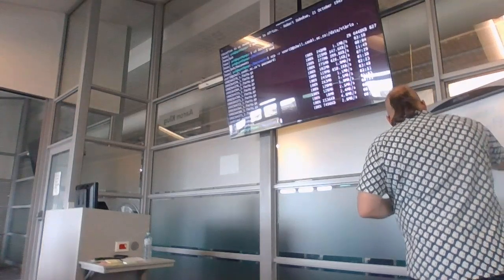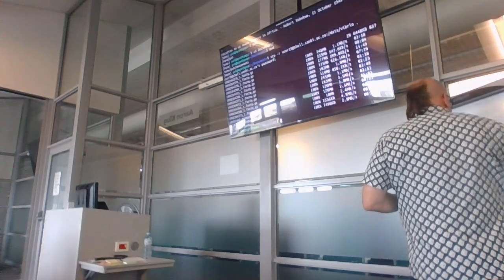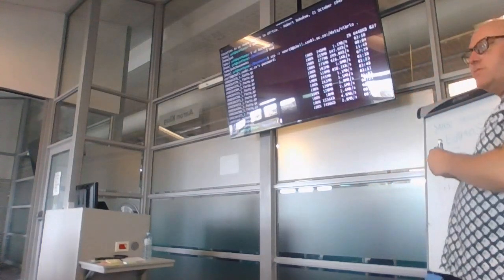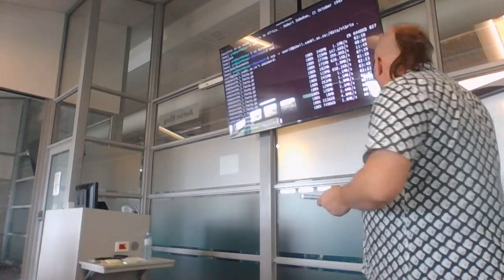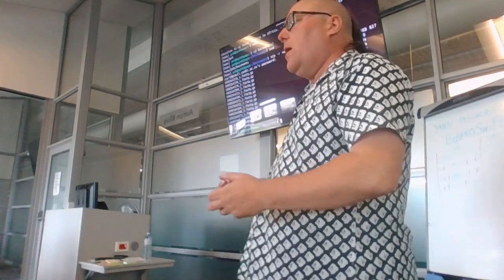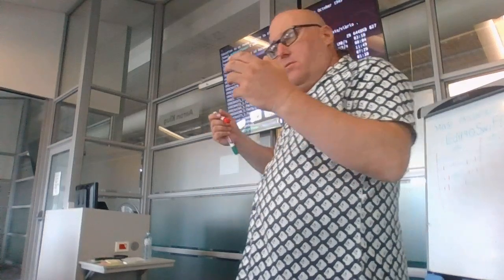So this is chromosome 1, this is chromosome 2. And then I map the reads. I map the reads against my combined chromosome. Okay? Well, how can I do this? Why is this not a heresy? Because I'm still collecting the genetic diversity of the two things together, okay?